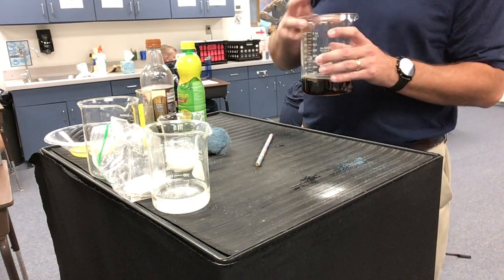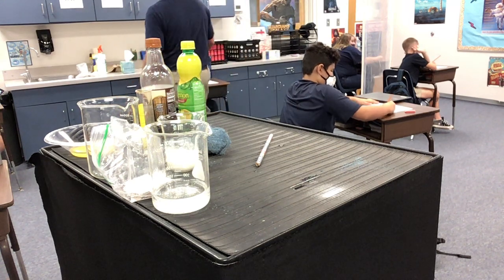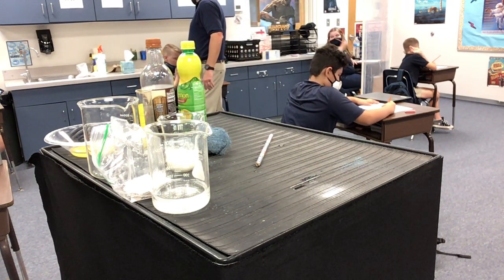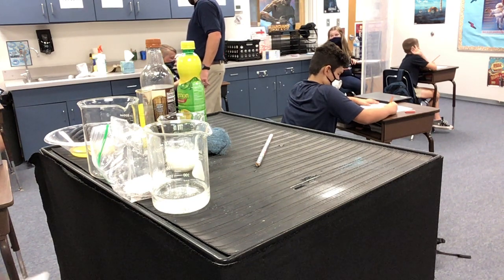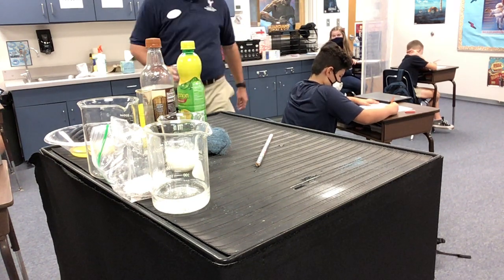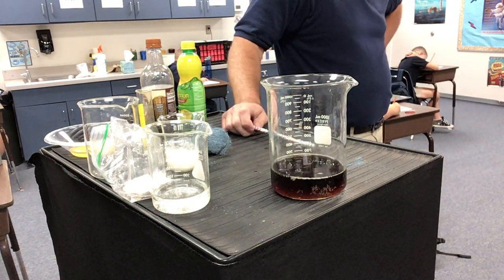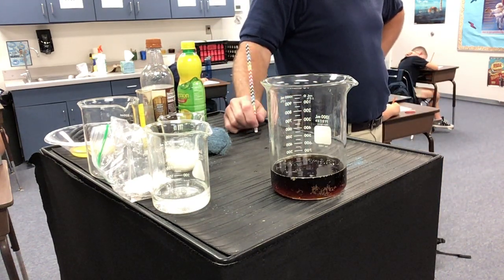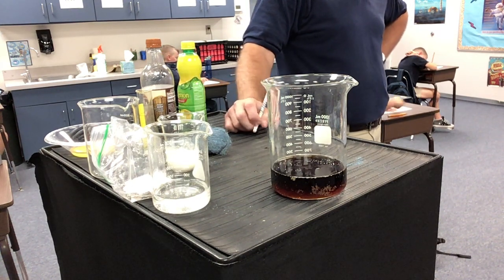Or have any smell, any odor? What do you say? Change the smell? Or does it smell like root beer? Feel it. Is it getting hotter or colder? Nope. Okay. Is there any physical change you can have on this? Or is this a chemical or physical change, and why?